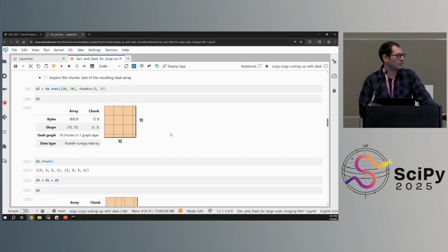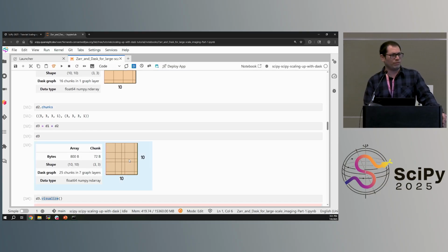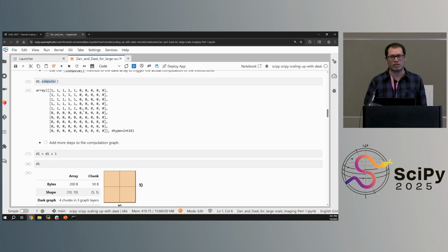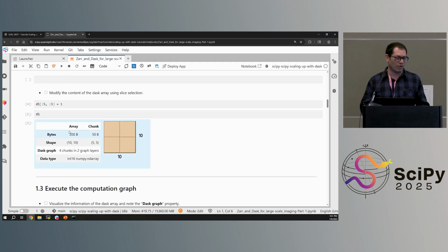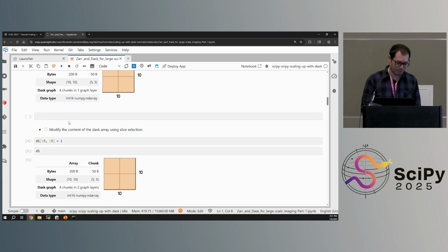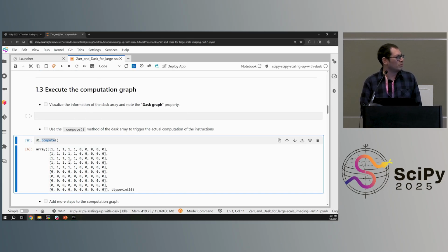And finally, Cellpose, this is going to be our deep learning framework that we are going to be using this time. We are going to be using Cellpose 3. They have recently dropped a version 4 that has transformer-based models. But for the purpose of this workshop tutorial, we're going to be using Cellpose 3. It was very well welcomed by the bioimage analysis community because of all the examples that you could handle with that model. So this is why we need those packages.